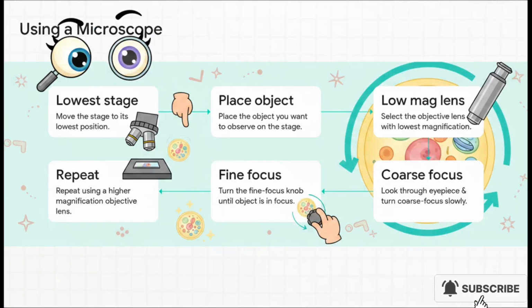All right, let's get you trained up. Following these golden rules ensures safe and effective observation. First, always start by moving the stage down to its absolute lowest position before you carefully place your object. Crucially, you want to always select the objective lens with the lowest magnification first. This gives you the widest field of view.